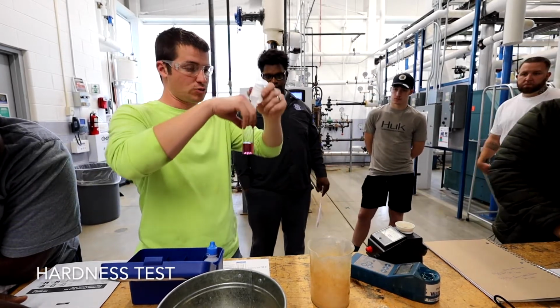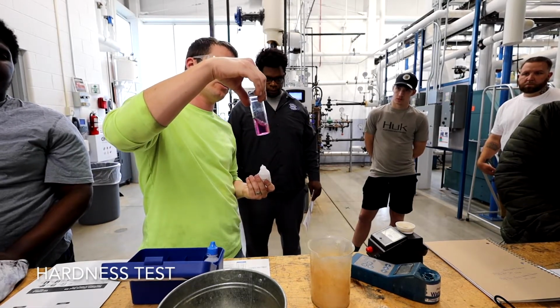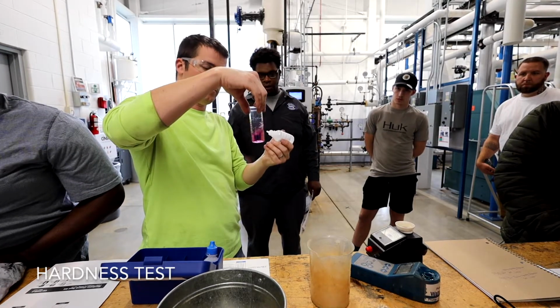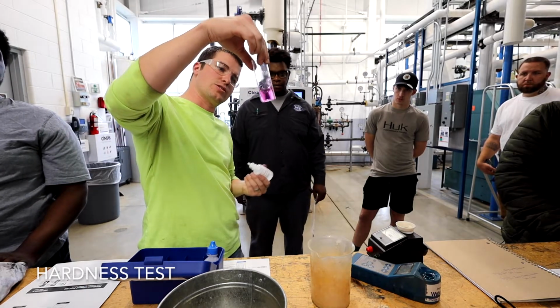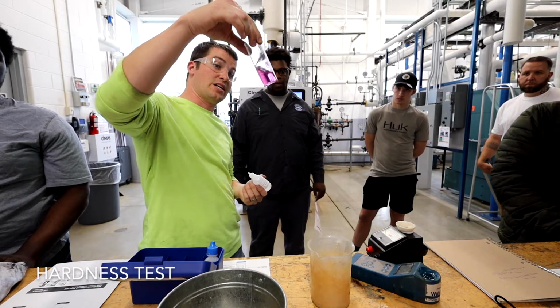So we're going to add this 1 drop at a time. 1. The colder the water sample happens to be, the slower the color change occurs. 2. 3, okay, it's starting to turn a little bit. 4, okay, it's getting more purple.